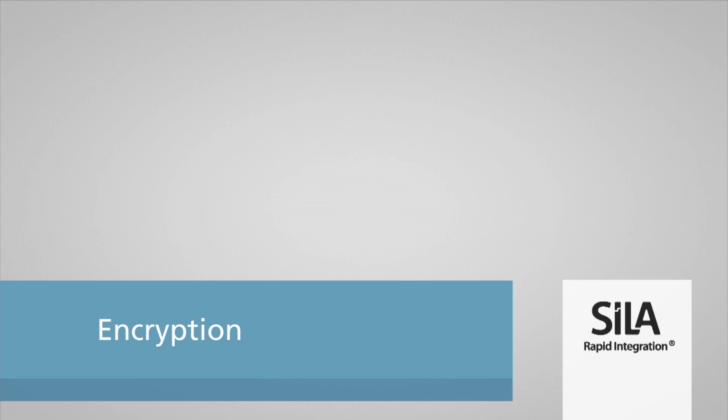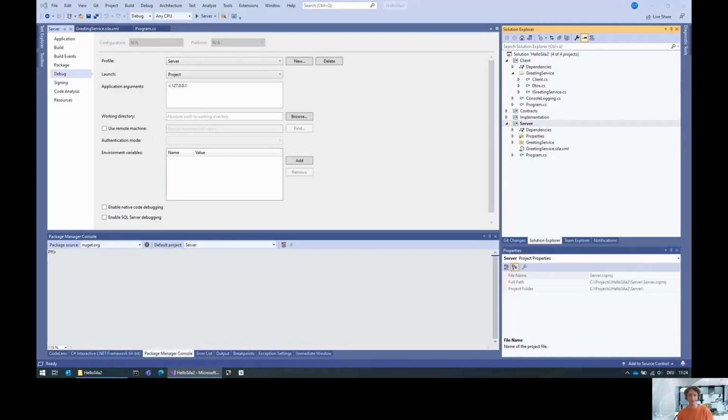Hello, my name is Georg Hinkel, and in this short video, I'm going to explain how you can implement encryption for your SiLA 2 server based on the Tecan SiLA 2 SDK.